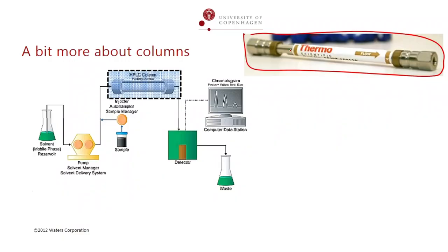And the stationary phase is actually inside this one. You can see the white color silica if you open these two nuts, but don't try that one at the lab. Because each column can cost you approximately 80,000 rupees to 1.1 lakh, 2 lakhs, something like that. Your supervisor will be super unhappy if you try to open it. You're welcome to do it, but don't tell them that I told you to do that.